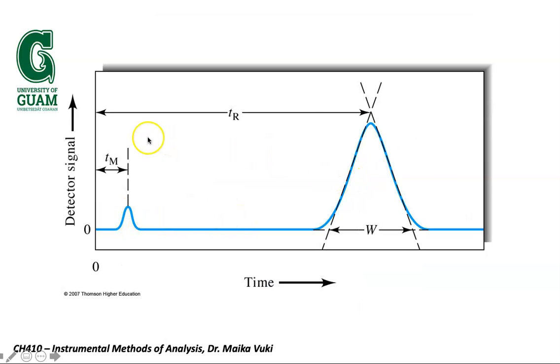Now what we can do is improve that measure a bit more. Instead of just using half the height, we can take the shape of the triangle here, because in that way we can increase the total amount of the analyte that we are looking at. So if we do this and take into account the width and the area of the triangle, we are considering to be within 96 or 98% of the analyte in here, which is a lot better than just 68%.